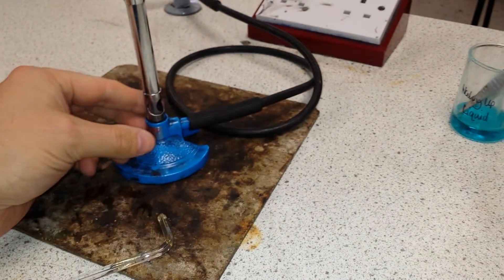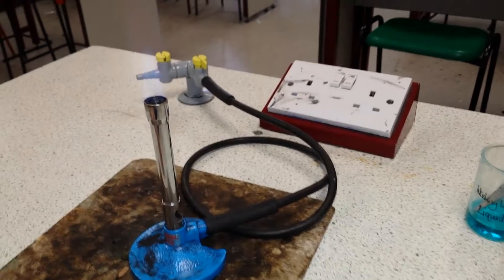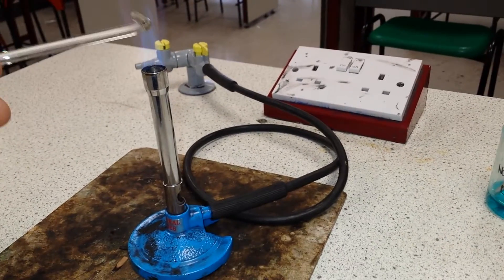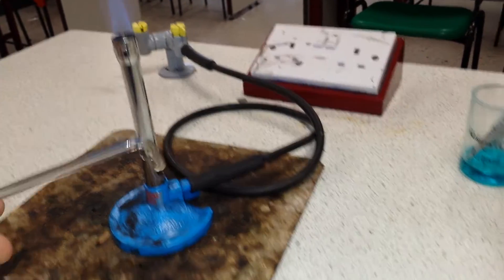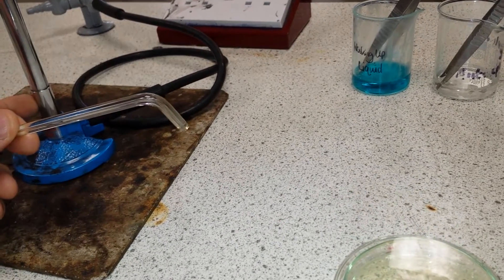We then get a roaring flame on a Bunsen burner with the air hole fully open, and we heat an inoculating wand. This one is a glass one; often you get a metal one with a loop.